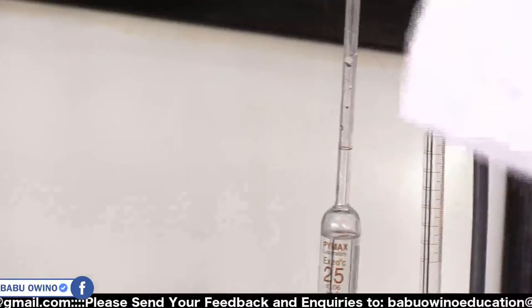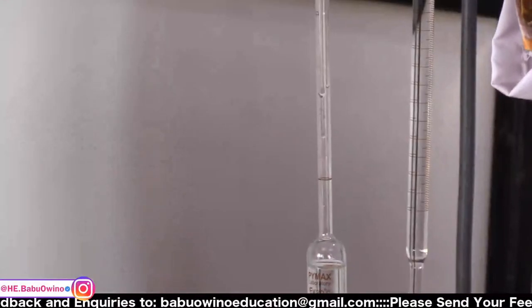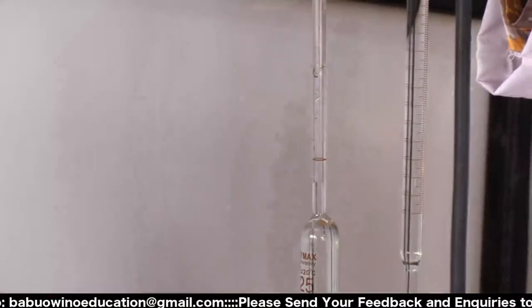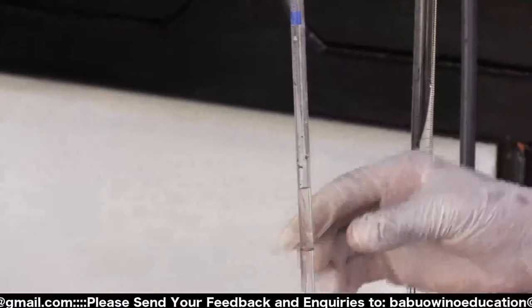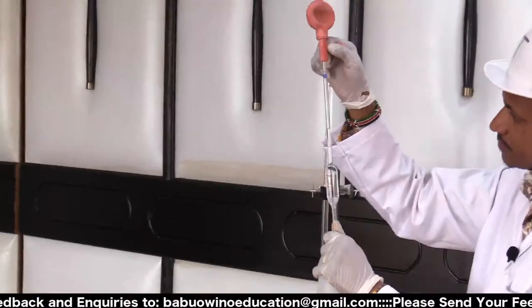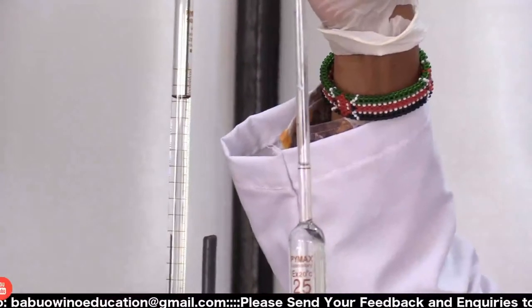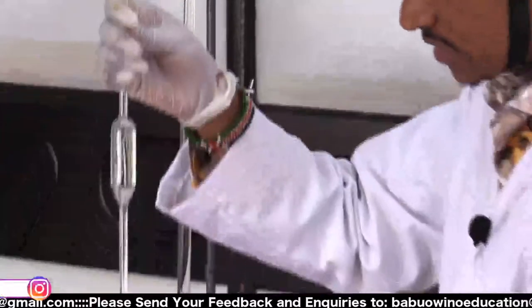So you feel it. When you see that it's taking some little time, again release here. Then you press simultaneously. Then again you refill it, you feel it. You press hard, use a little energy. Make sure you pass the mark. Then after that, release up to the mark. And then you make sure you read it perpendicularly. So ensure that you are careful when handling this. So you release using this side of the pipette. Slowly. Then you read the bottom of the meniscus. There you go. So that's our 25 milliliters.